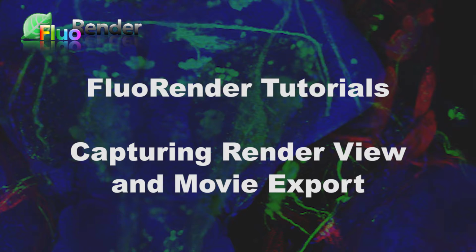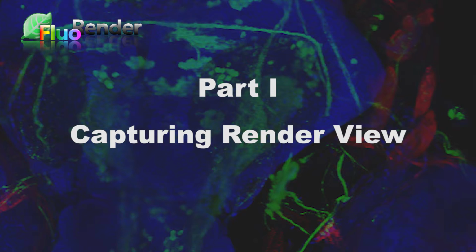FluoRender tutorials. Capturing render view and movie export. Part 1. Capturing render view.